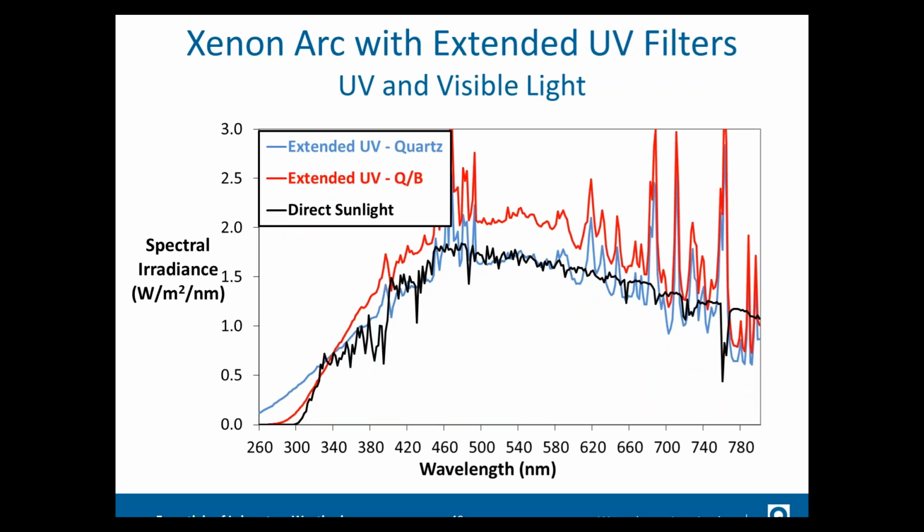And then here are some examples of the extended UV filters, and as you can see, the cut-on is far shorter than the actual cut-on of noon summer sunlight. So again, not realistic, but that might be the test that you're looking for.